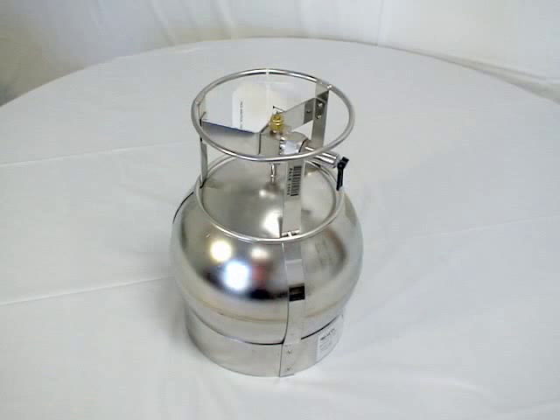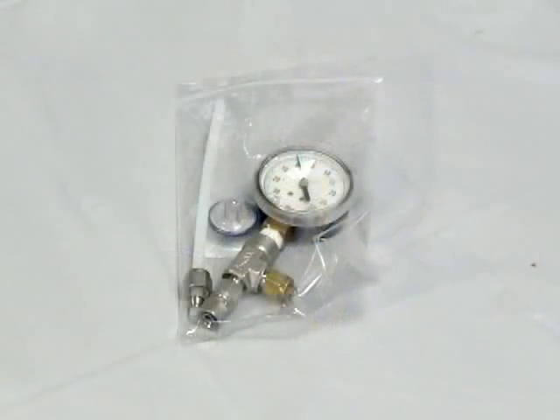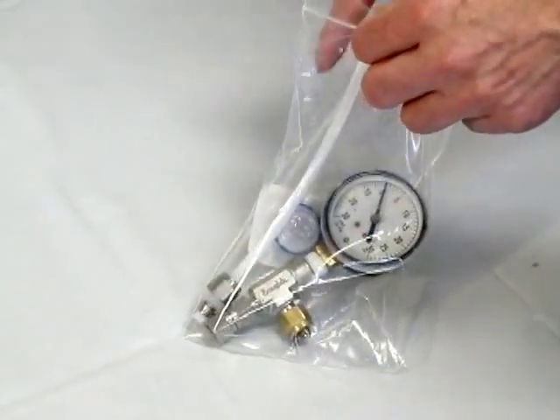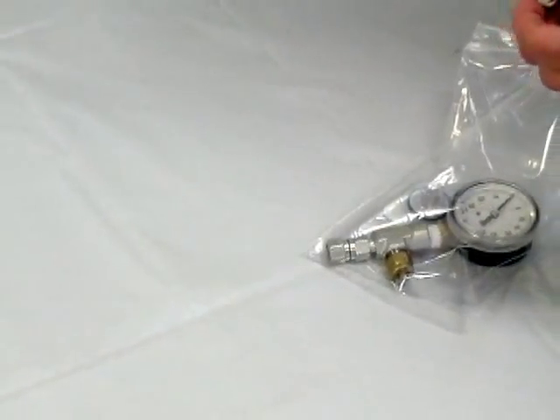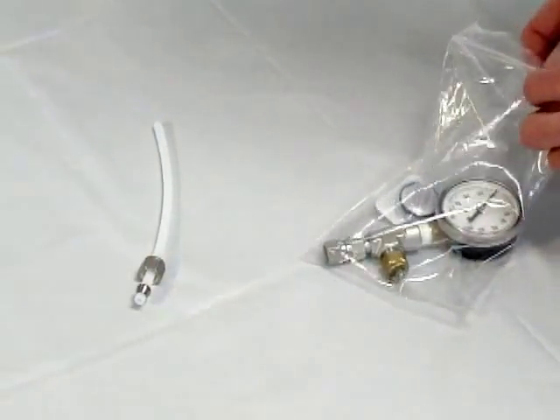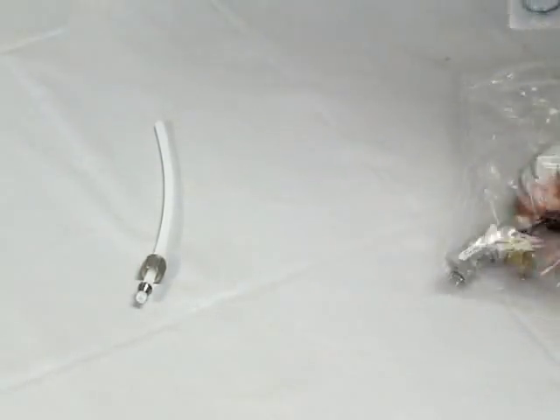Here is an example of the canister. The canister will arrive with a protective brass cap on the sampling valve. If you are collecting at a predetermined sampling point, you will have also received a bag of materials with the order. If you received this, it was prearranged at the time the order was placed by your PACE project manager. Inside the bag is the tubing, swage lock fittings with ferrule, and moisture filter.